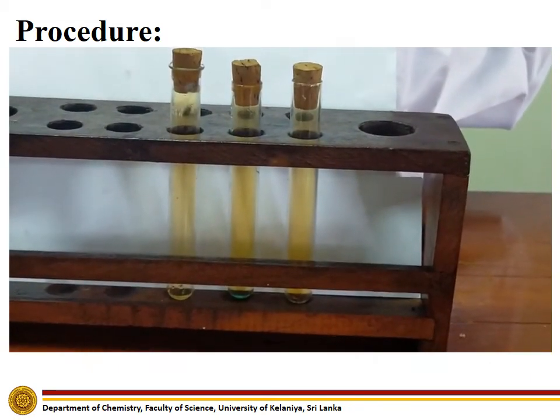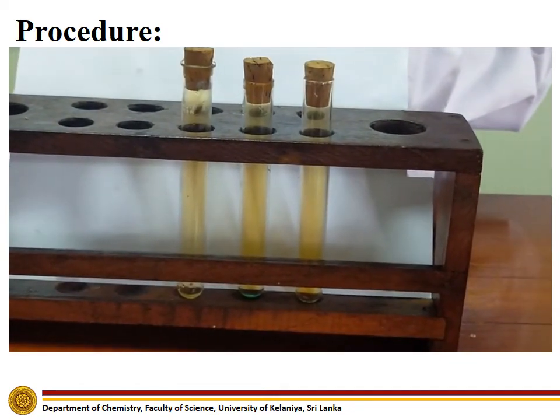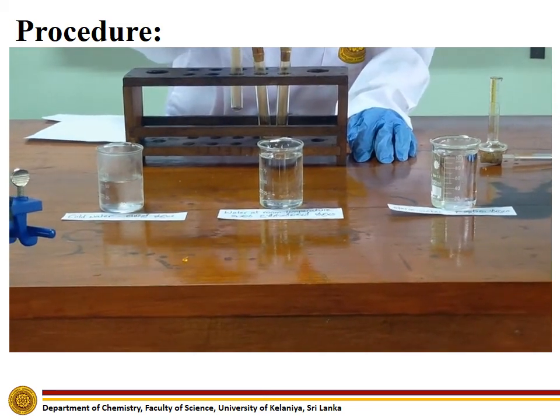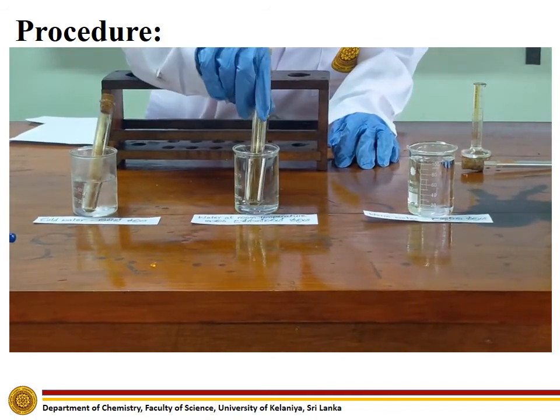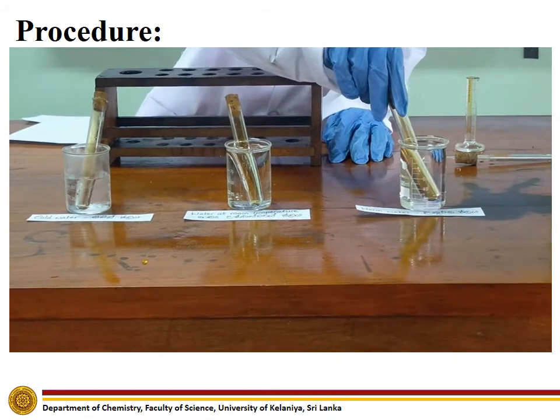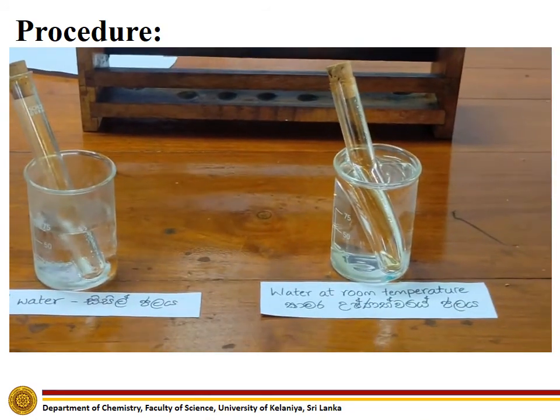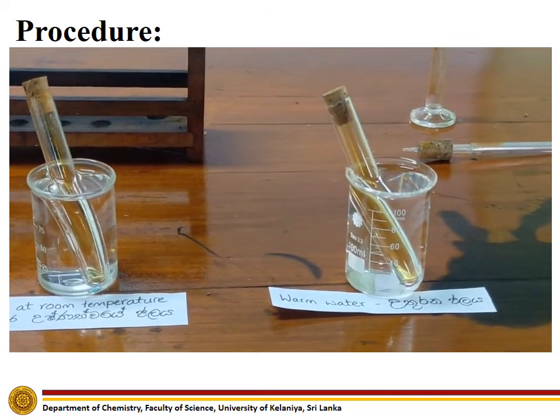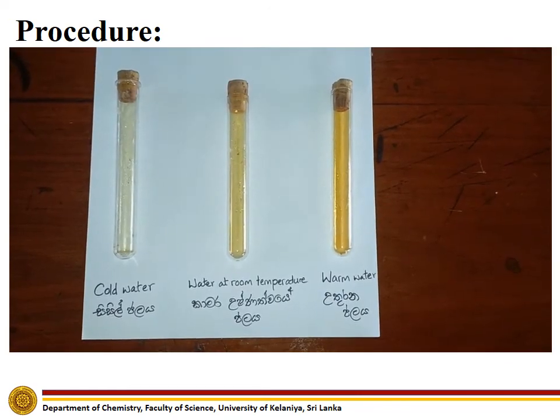After collecting the gas, close the test tubes tightly with rubber corks. Next, place the tubes — one each in beakers containing cold water, water at room temperature, and warm water. Observe the relative variation in the color intensity of them and compare with the one at room temperature.